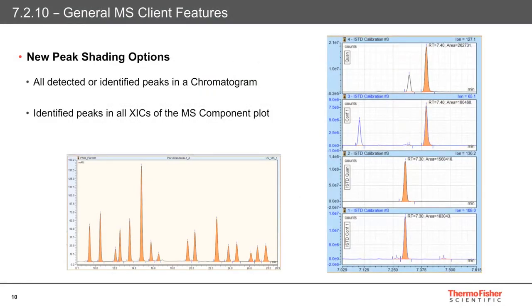To enhance the MS experience, further client features have been added to the software. I'll start with the new peak shading options available from the peak characterization tab via properties. Peak shading can be applied to all detected or identified peaks in a chromatogram, as well as the identified peaks in all extracted ion chromatograms, or XICs, of the MS component plot. It makes life easier when viewing data or trying to spot discrepancies during data review.